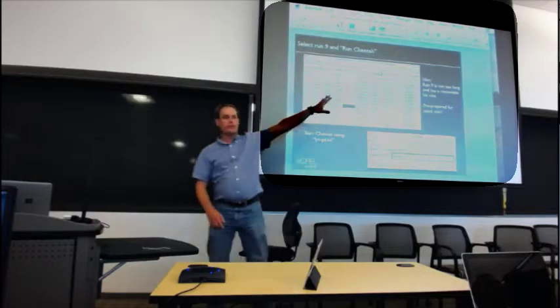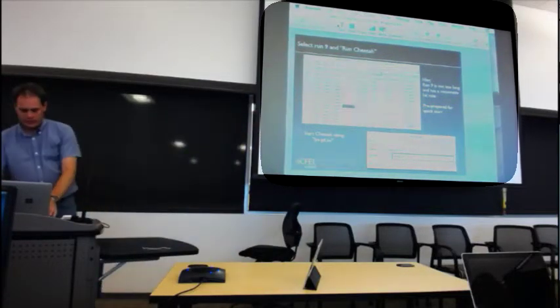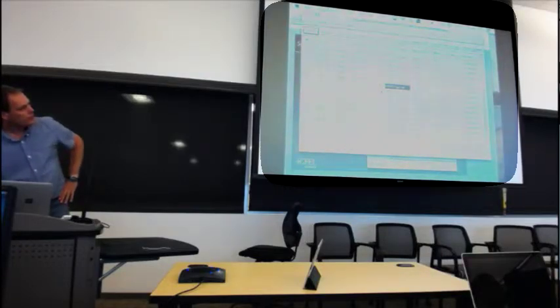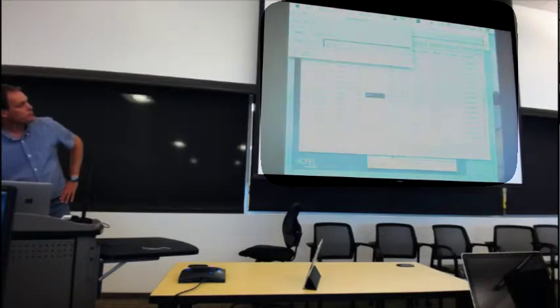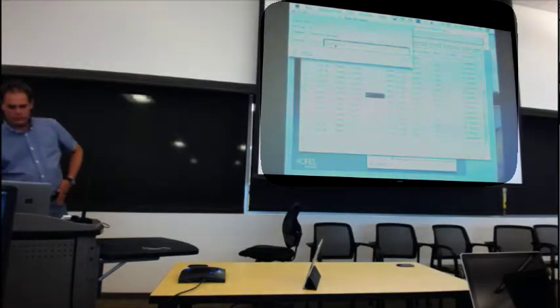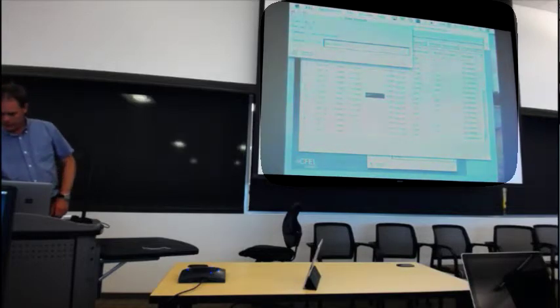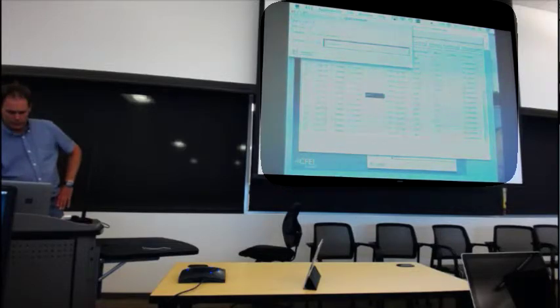Let's say I want to process one of these runs. Now, in the interests of things actually running in a reasonable way, I created a couple of templates there to actually do your own thing. So you can click on a run, say run 9, like that. Then you can go run Cheetah. Pick this ini file, which, to cut long things short, specifies the way the Cheetah is going to run. Okay.